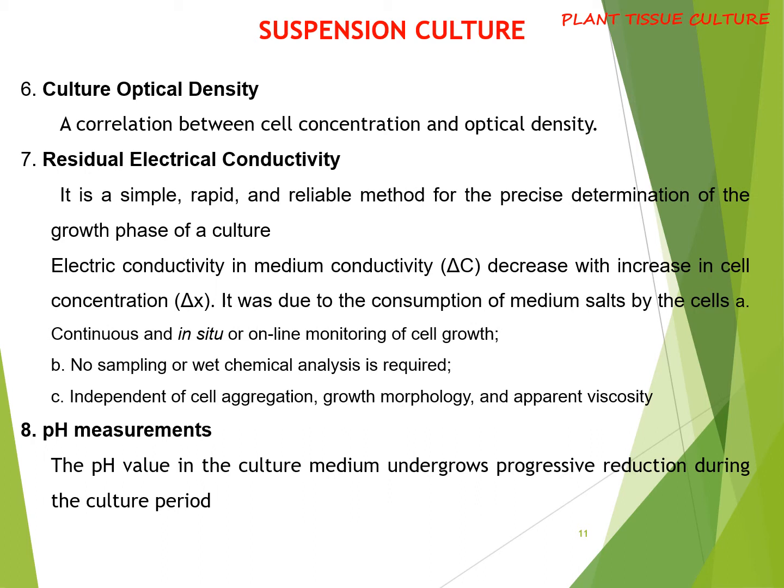Another method used is to check the electrical conductivity. It is a simple, rapid, and reliable method, and there's no need of pipetting or taking out cell culture. It can be done continuously in situ or online monitoring of cell growth. Here too, the probes are used to check the electrical conductivity.